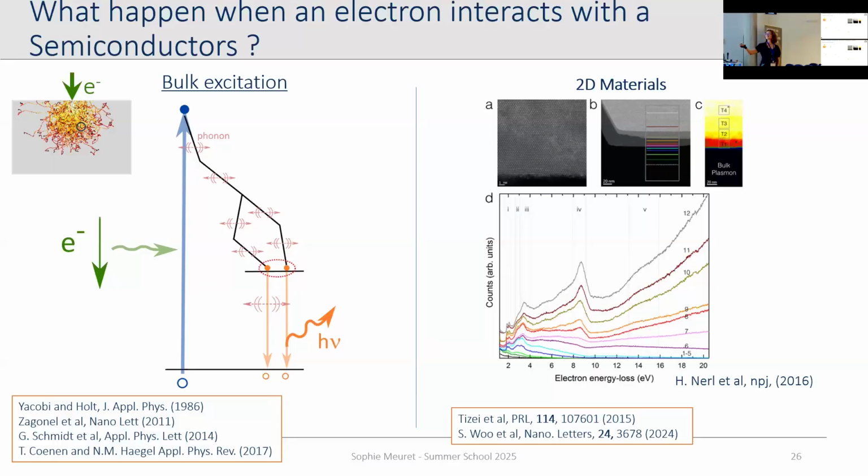No, I'm kidding. But basically, the idea is that whatever the excitation is, bulk plasmon or excitation directly by an exciton, what you will see if you look at cathodoluminescence is the emission from the band gap. I will talk a little more tomorrow about how we could maybe start to distinguish between the two. But for now, let's say it's the same thing.